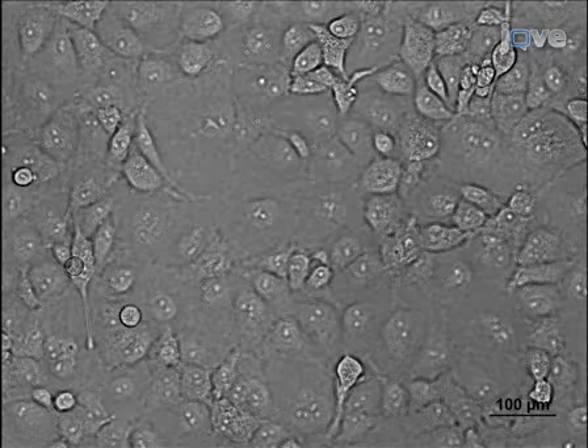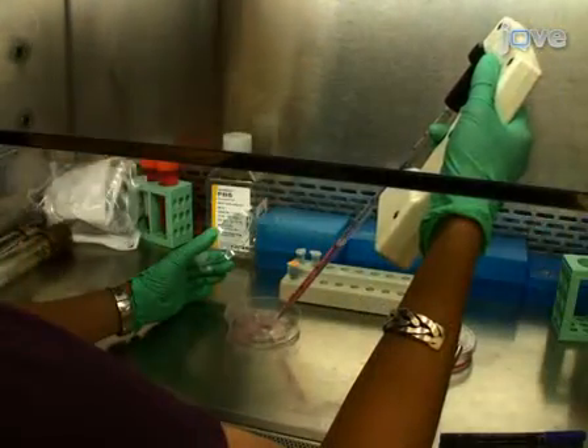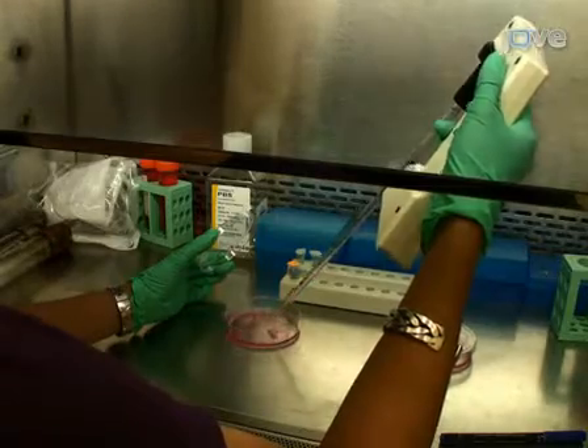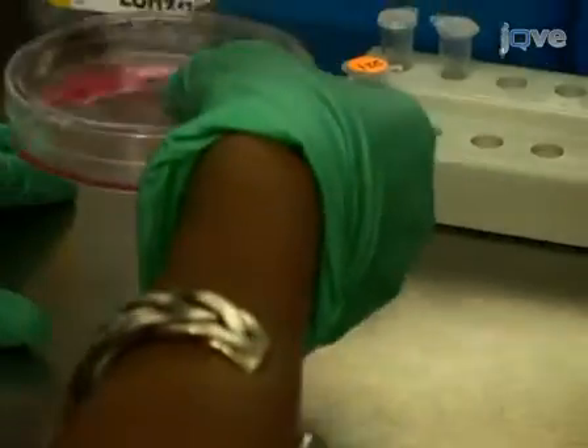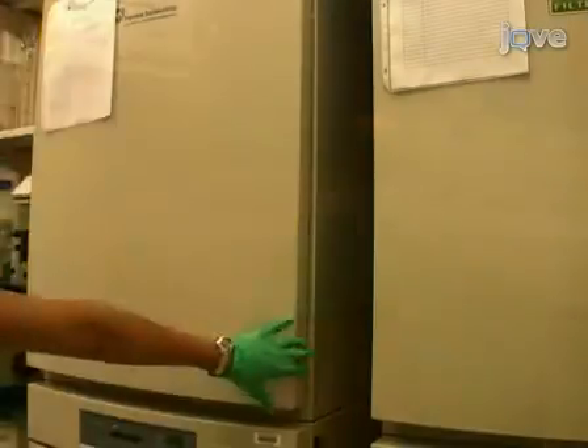COS1 cells used in transfection are cultured in DMEM 10% FCS using standard tissue culture protocols. One day before transfection, split COS1 cells into new 100 by 20 mm dishes to approximately 2×10⁶ cells per plate and incubate at 37°C.